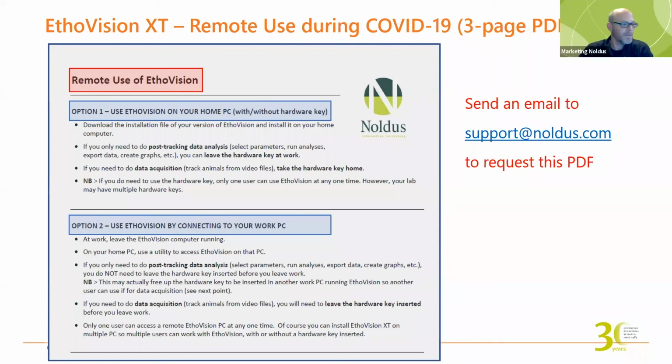You got time for one more, Wieland? Oh, absolutely. Regarding the velocity of movement in the open field, do we have to set the different velocities ourselves, or does the software provide different velocities, high or low, for mice?